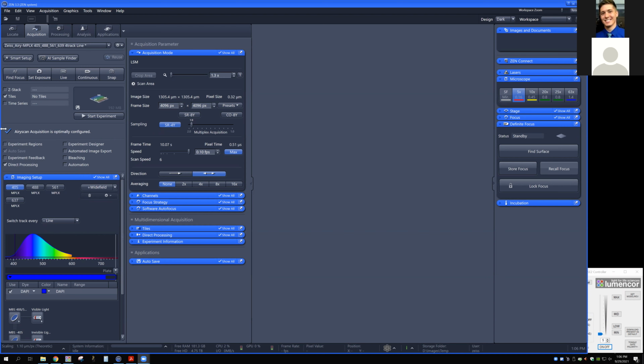So we'll jump right into working on tiles with the carrier overview. And so we have a plate that we just pulled out of the fridge. It is still warming up to temperature and condensing, so we're going to give it a minute as it does. In the meantime, I will start to go over the tiling setup here and show you a little bit about what that looks like.